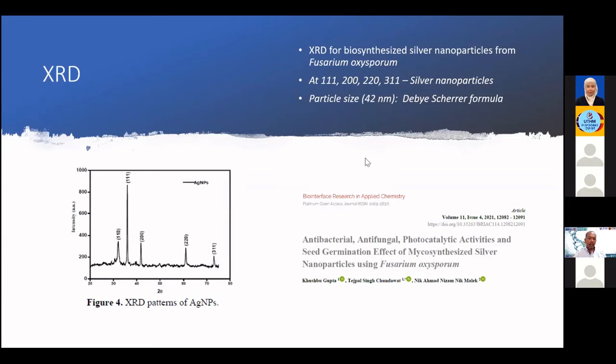So there are actually other applications of XRD. It's not just looking at the XRD diffractogram and then matching with the PDF to get the structure. Actually, in physics, if you understand the fundamentals of X-ray diffraction itself, there are many applications that we can do. For example, here we can determine the particle size. We can determine some of the physical properties from the XRD. We can determine the impurities inside the sample.